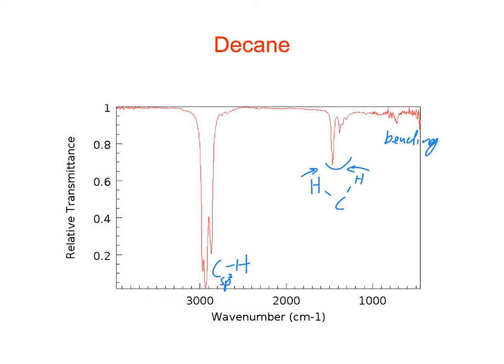Well, I think it would just depend upon the nature of your sample. If you have a liquid sample, then you can just put a drop of that on KBr or salt plates. The thing about using salt plates is you need a sample cell or sample holder that's invisible to the IR, so we use these inorganic salts that don't absorb in the IR.